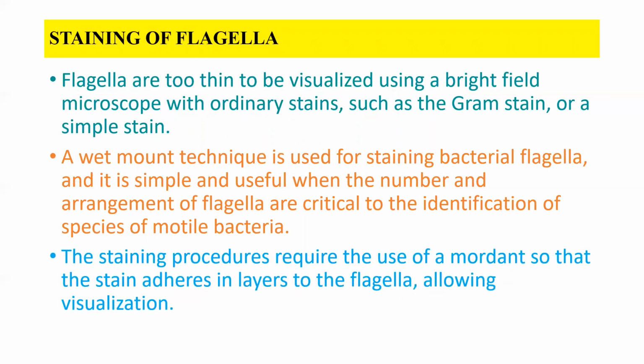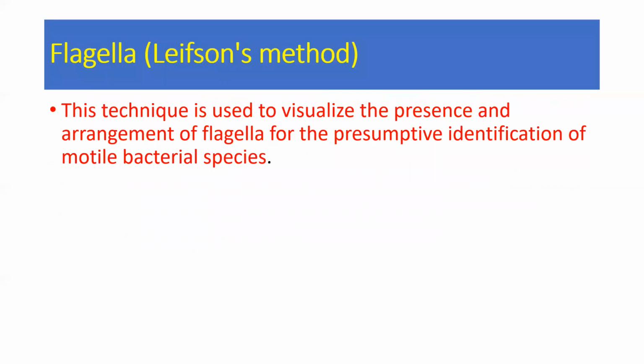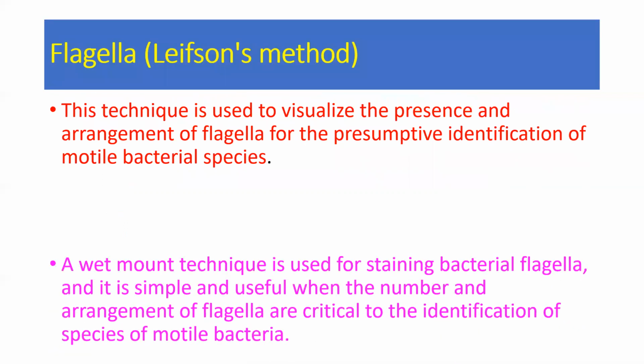The staining procedures require the use of a mordant so that the stain adheres in layers to the flagella, allowing visualization. Flagella are stained by Leifson's method. This technique is used to visualize the presence and arrangement of flagella for the presumptive identification of motile bacterial species.